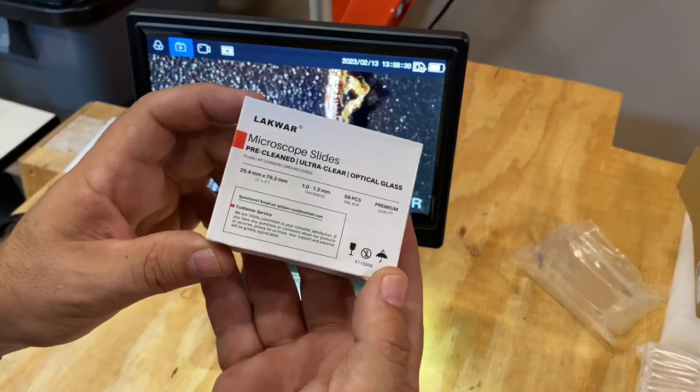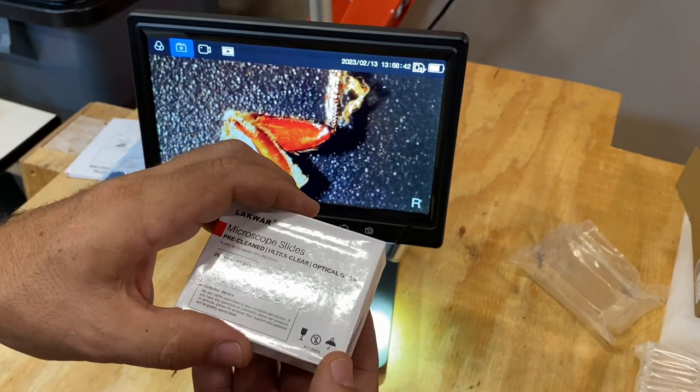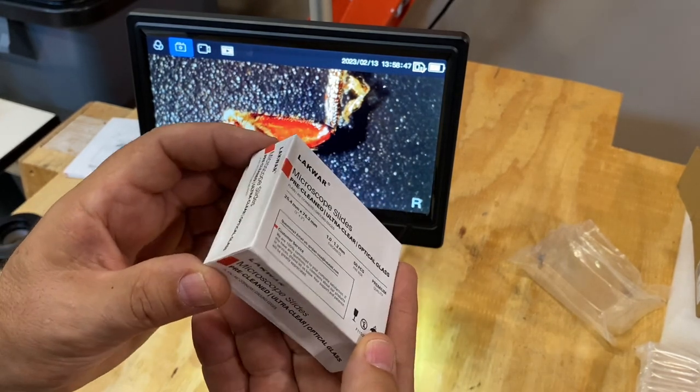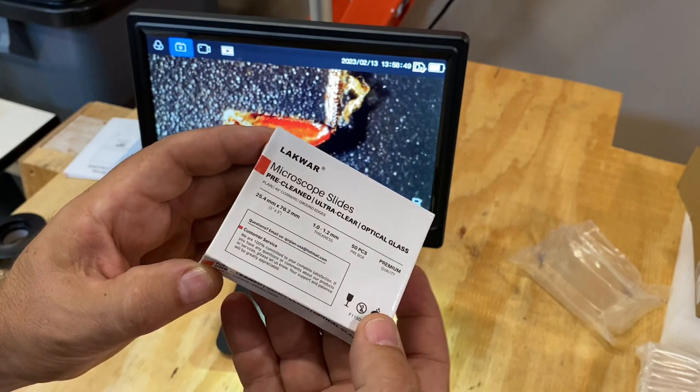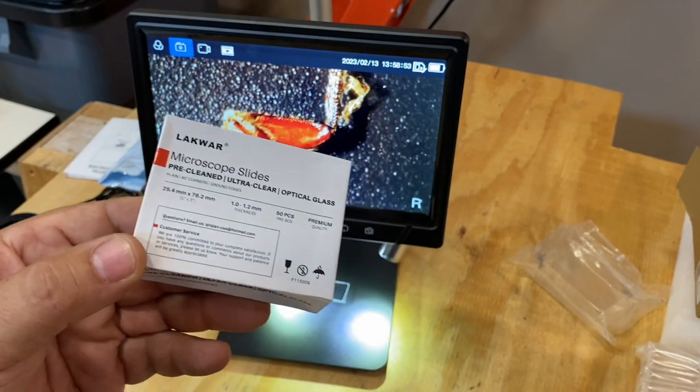Overall I'm very pleased with these microscope slides. You can see that they work really well, they're packed well, premium quality — definitely well worth your investment. I hope this video was helpful and this information was useful to you, and as always I hope you have a great day.